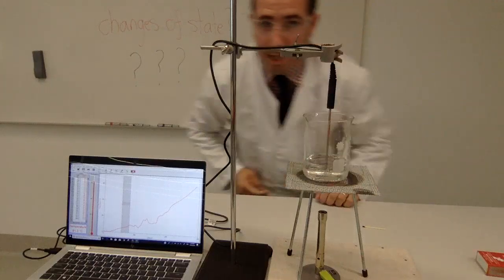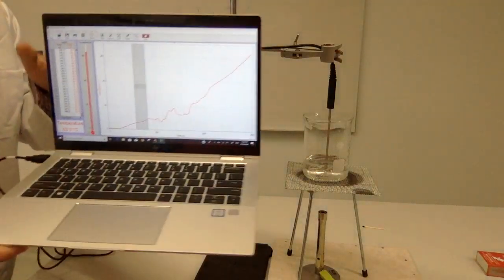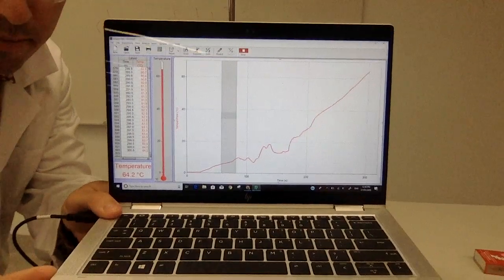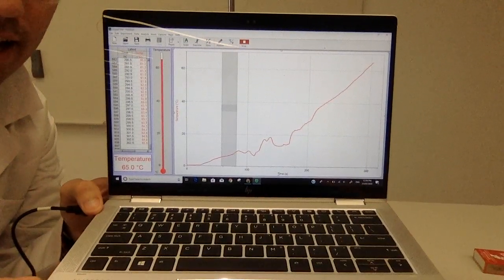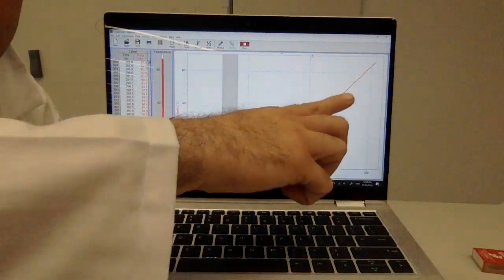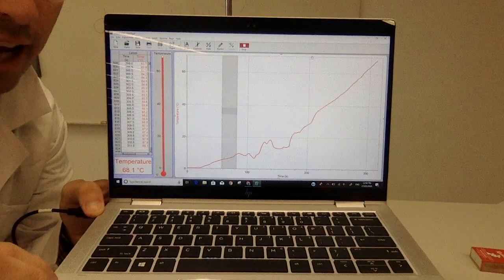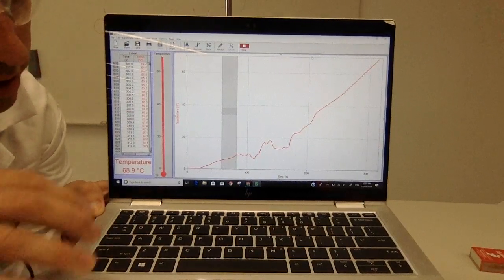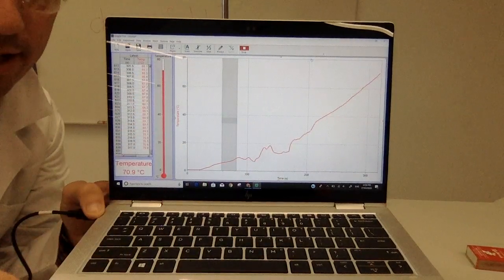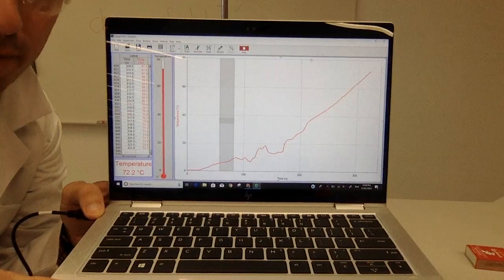Bring this up closer so you can see what I am seeing. Be very careful and wow, isn't that amazing? Now this is what we want to see, a straight line here. This is what we saw a couple of weeks ago in our experiment, and so that's good. So there was something we could probably do again to smooth all that bottom bit out. So again, that's where we get reliable results by repeating it.